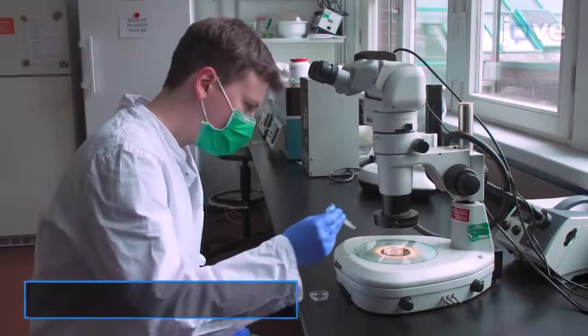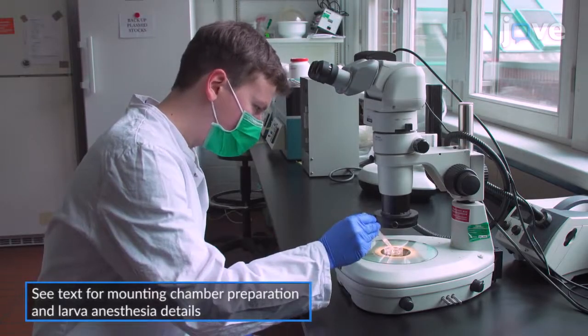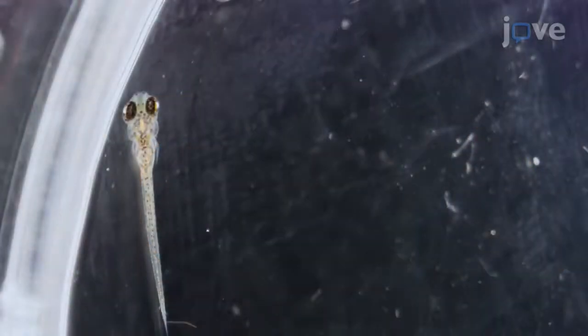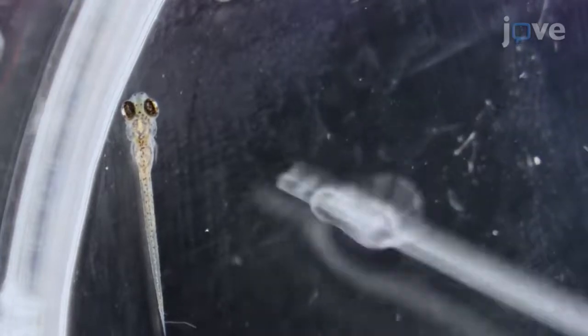To embed the larvae, use a pasteur pipette to transfer the anesthetized larvae to a mounting chamber under a stereo microscope. If any larvae are still able to move, do not use the fish for the experiment until the fish are completely unable to move. When the larvae are immobile, carefully remove the larvae.